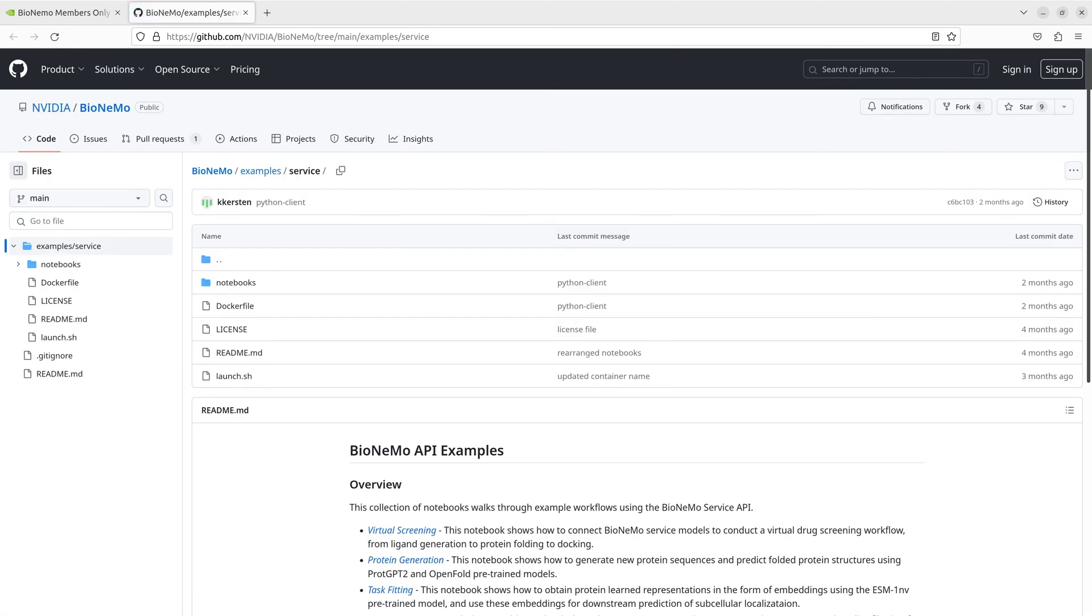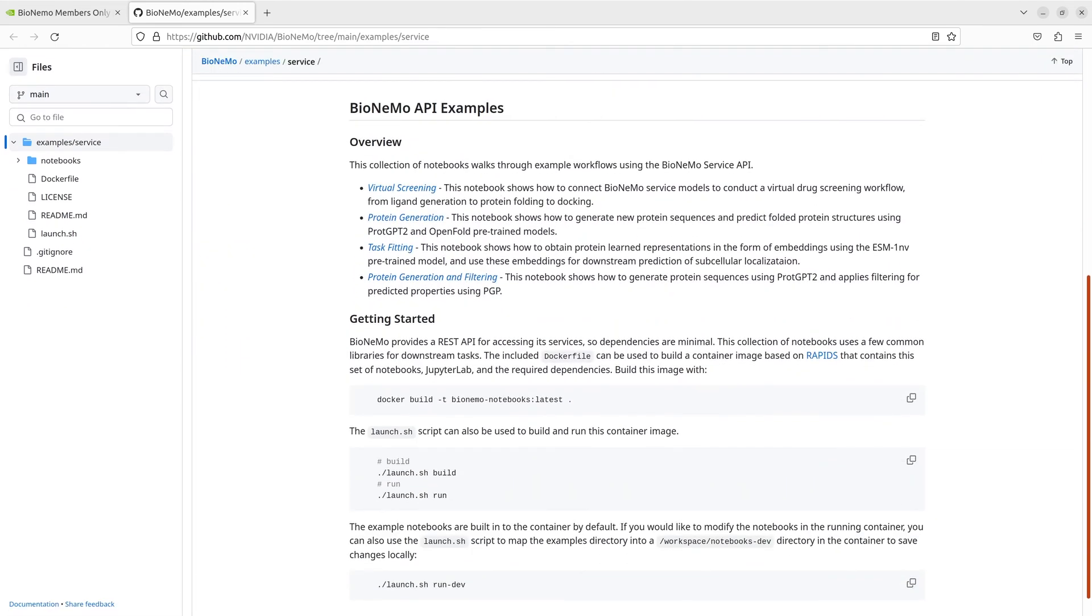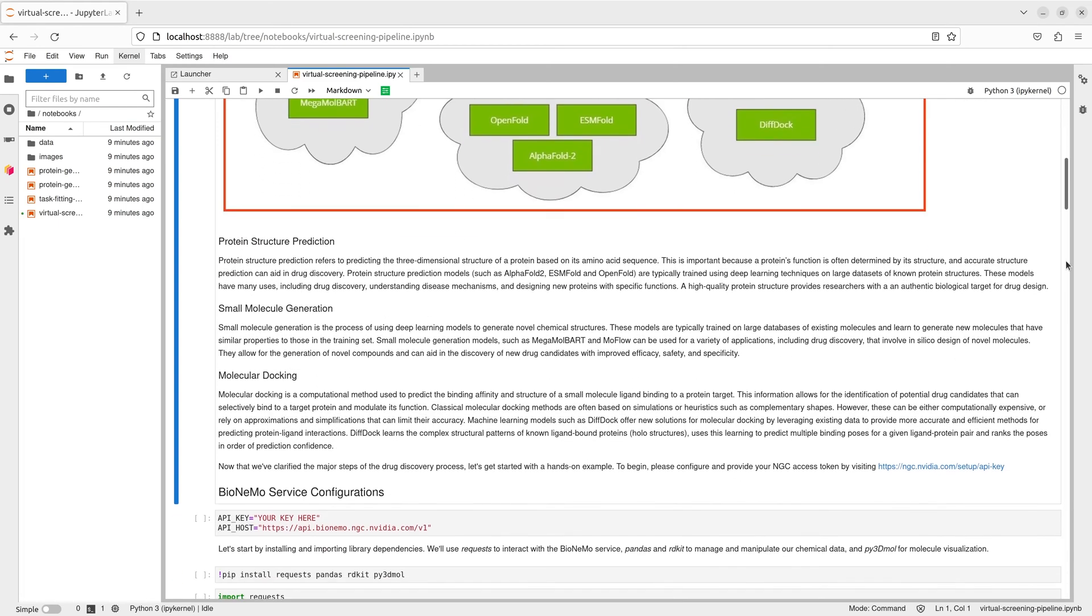To get started, we've cloned the GitHub repository and prepared a container with the example notebooks using the included launch script. After launching the container, we can access the example notebooks in a web browser. The virtual screening workflow uses Bionemo models for protein structure prediction, small molecule generation, and molecular docking to predict binding affinity of the small molecule ligand and protein target.